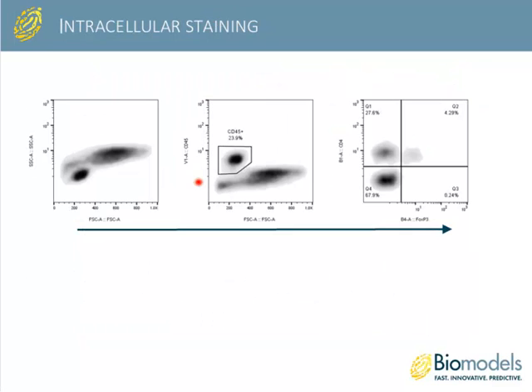So just one more example here. This is a colonic lamina propria prep. This is about as dirty as cell preps get. There's a lot of dead stuff in this prep. This is a lot of dead cells, cell debris, and epithelial cells, that sort of thing. And that's just because it has to go through a lengthy digestion process to yield a single cell population. But because we're just interested in leukocytes, we can stain for CD45, which is the pan-leukocyte marker, and you get this very nice, distinct population of leukocytes here.